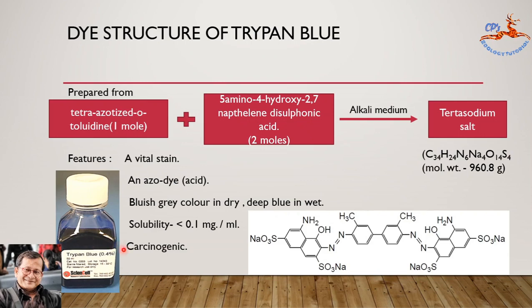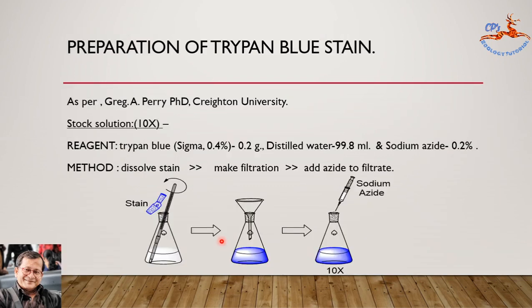But this histological stain is carcinogenic in nature. That's why washing with water and soap is a must if you touch it to the skin accidentally. Now, I am going to prepare this in the laboratory for your experiment. Okay. Now let us go into the preparation.